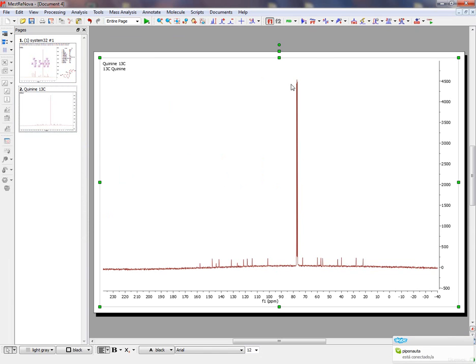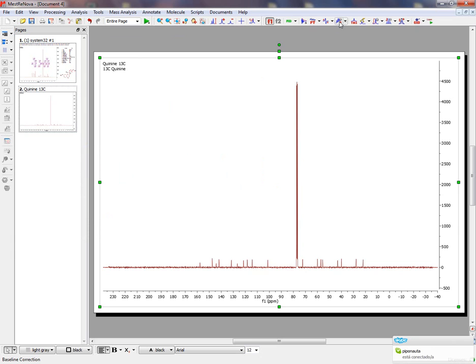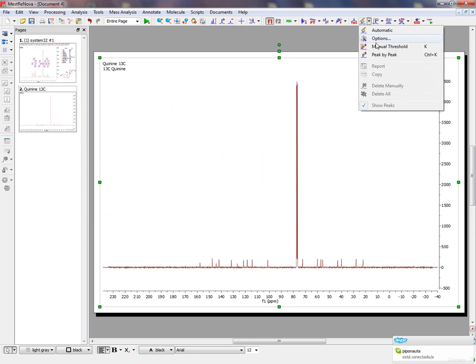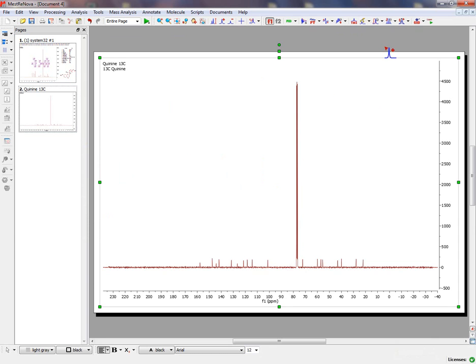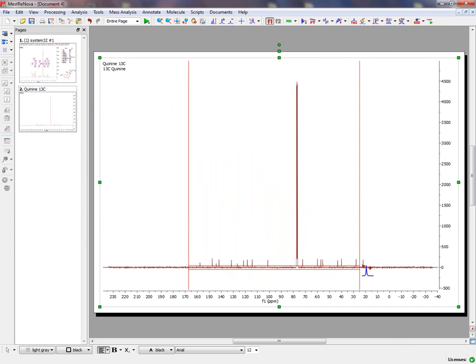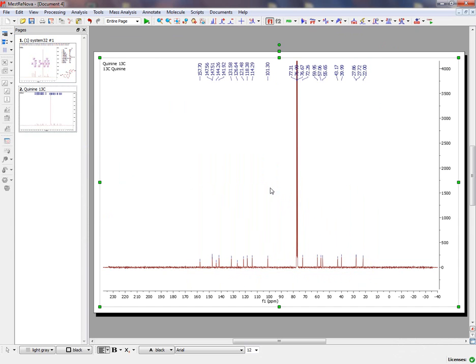Here you may be interested in applying a Baseline Correction, an Automatic Baseline Correction, followed by Peak Picking. We are going to select a Manual Threshold and select the Peaks of Interest.